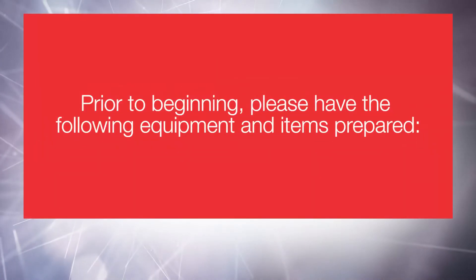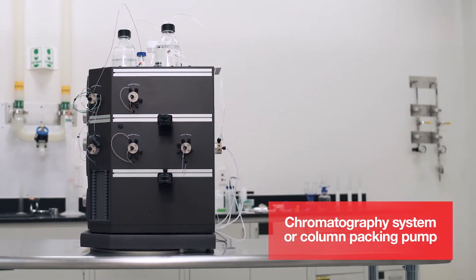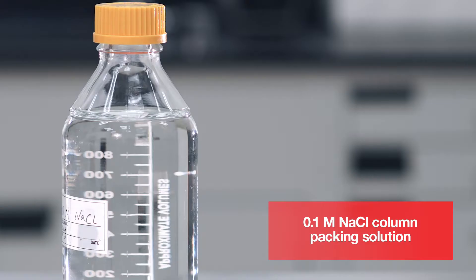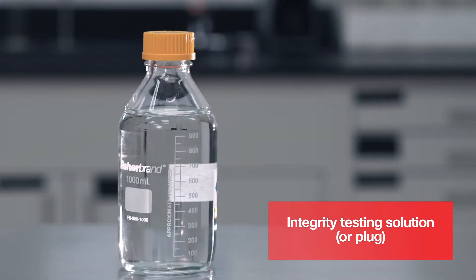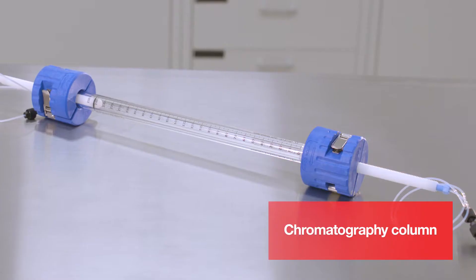Prior to beginning, please have the following equipment and items prepared: chromatography system or column packing pump, POROS 50 micron resin, 10 or 100 milliliter graduated cylinder, 0.1 molar sodium chloride column packing solution, squirt bottle filled with packing solution, integrity testing solution or plug, 20% ethanol storage solution, bottle top filter with vacuum pump, and chromatography column.